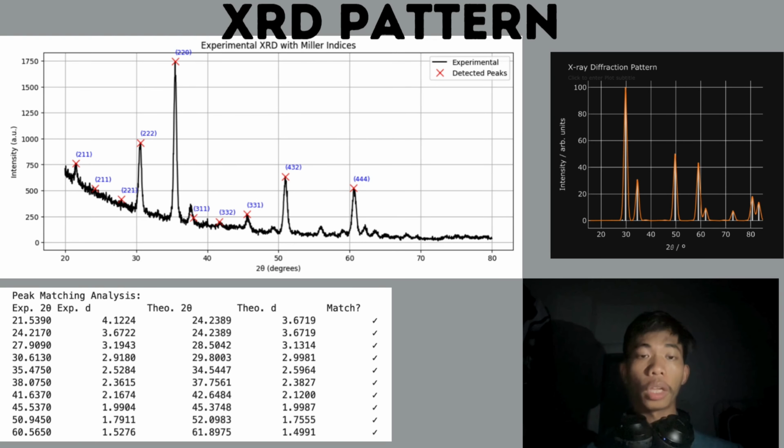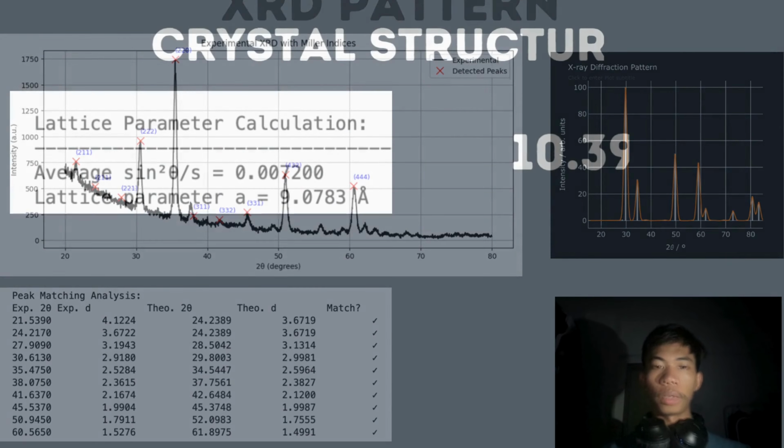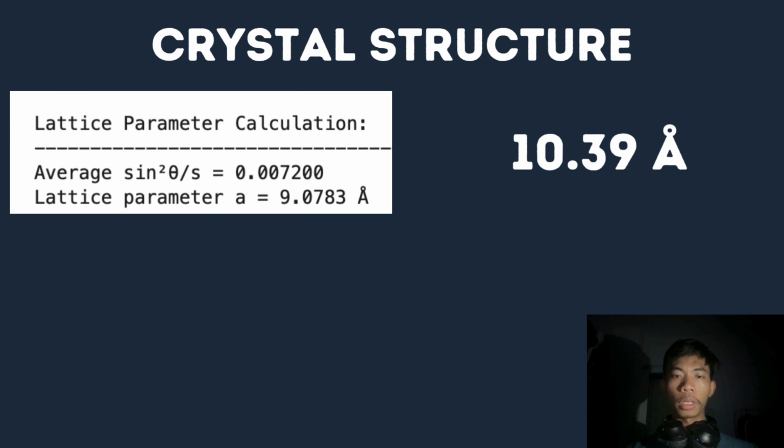So there's a slight difference, and this is due to the crystal structure and the different profile used in analysis by us and by the Materials Project, and then the X-ray diffraction patterns are also quite different from the analyzed XRD pattern. Next is the crystal structure.